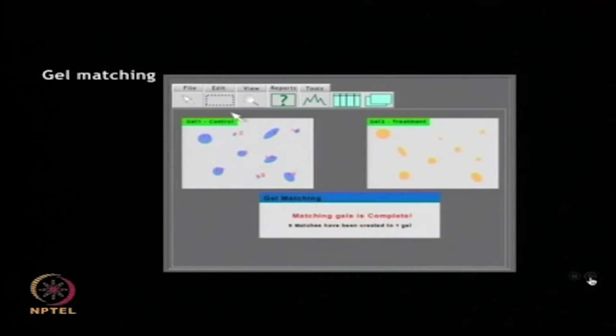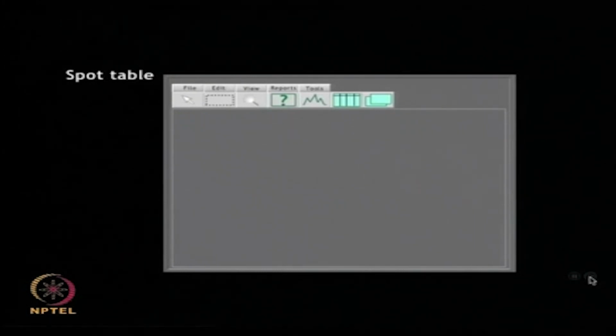Now, I will describe the gel matching. The software facilitates interpretation of the gel images by matching two different gel images which were obtained in your experiment. The matching spots are marked, and after matching is done, any variation in the spot intensity and spot positions can be indicated by the blue lines, as shown in the animation. This provides an understanding about the reproducibility across the gels.